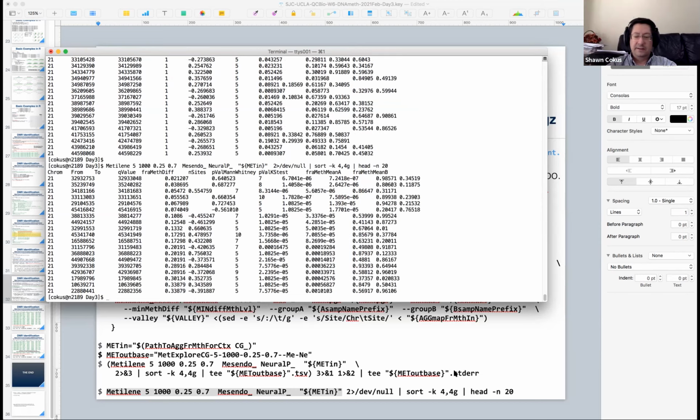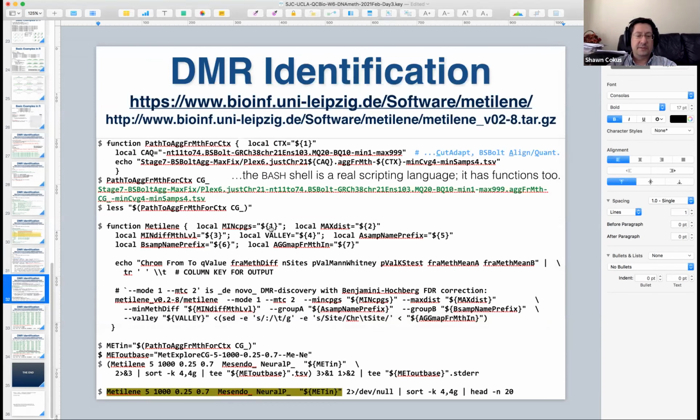Somewhere I lost all my Zoom controls. Oh, they're up here now. Okay, all right, so I gotta bring IGV into the mix now. Share screen. We need Keynote, that terminal, and IGV.